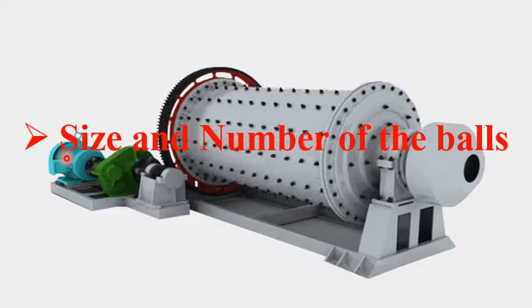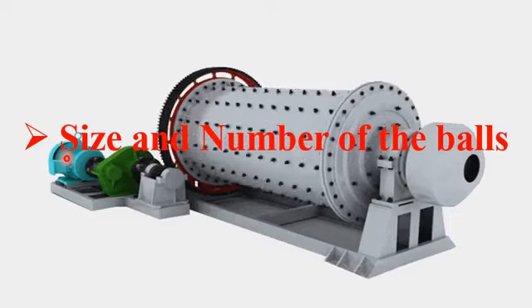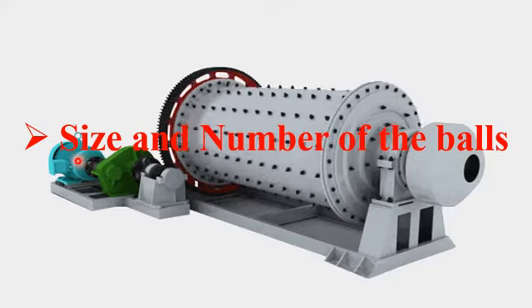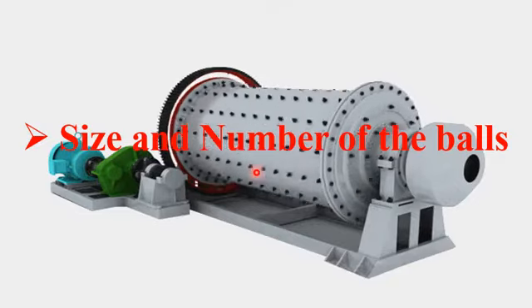Whereas the smaller ball used in the ball milling process is for converting a fine powder into very small nanoparticles or nanomaterials.